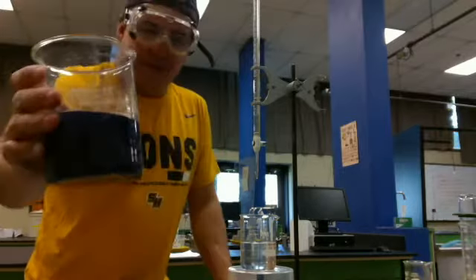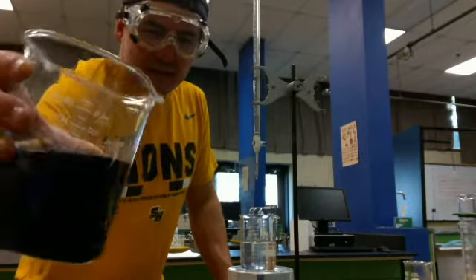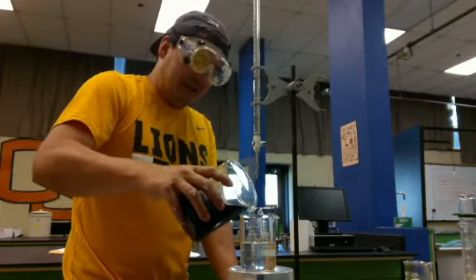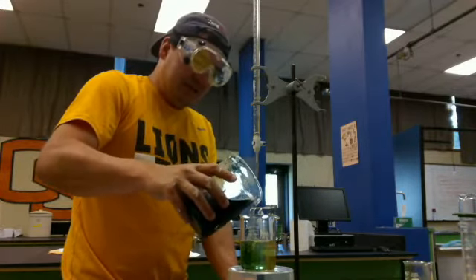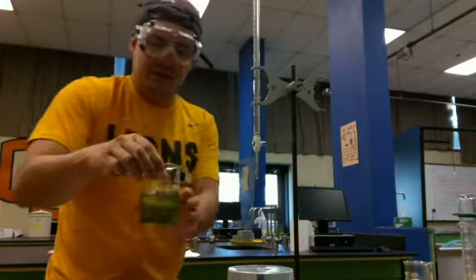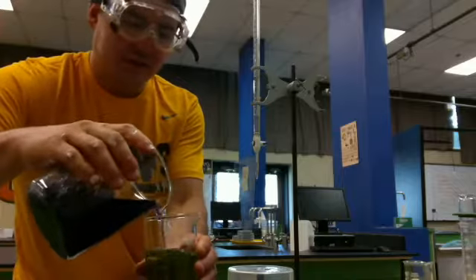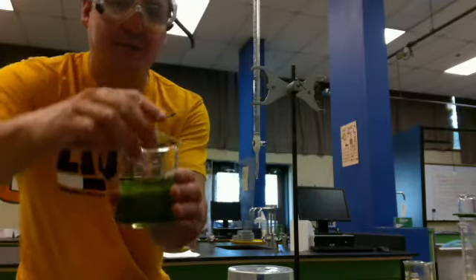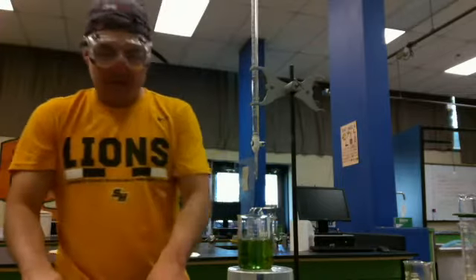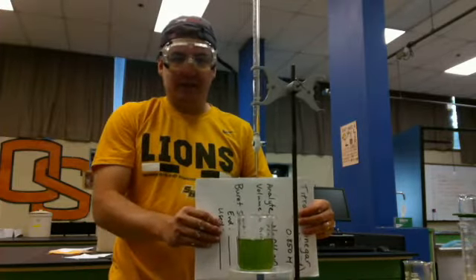So now I've got my sodium hydroxide in here. You guys will notice that it's clear. I've got my cabbage juice indicator. I just did this in the lab microwave. I'm just going to add a small amount so that we can see the color. And this should kind of match yours now. Swirl. I'll add a little more to try and make this intense. And I'll try and hold a white background. Right now it's green. So this should match yours. There's the green.